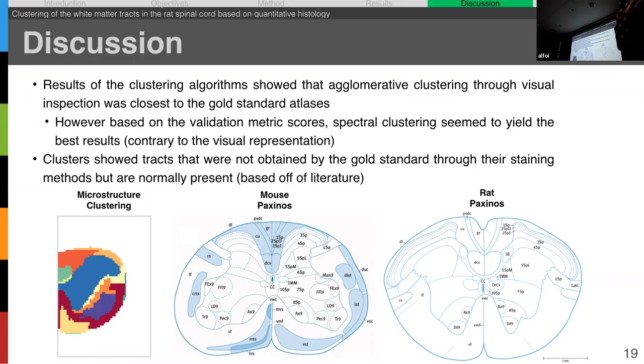And here, first it's a striking difference in the shape, but can you also comment about the size differences between the tracts? This could be one of these slides, and I think this is probably my fault. The example that they provided, because they only provide one example that has all the cervical levels, is C8 for this one, versus C1 for this one. This is C1 as well. So I think that's my fault. I didn't choose the right images.